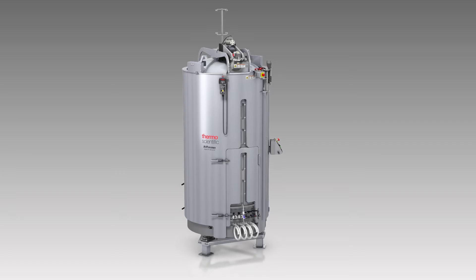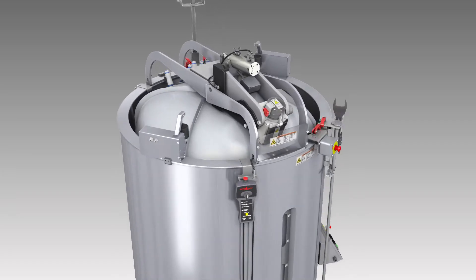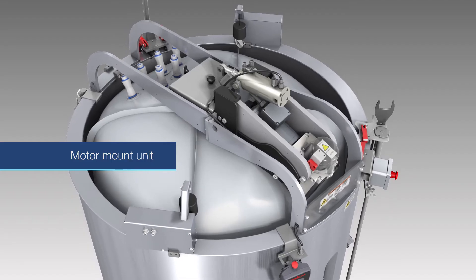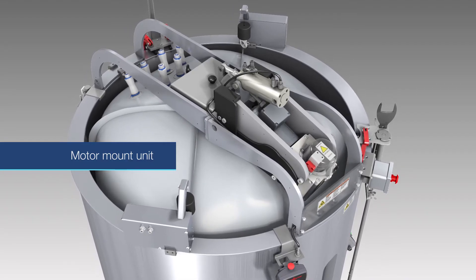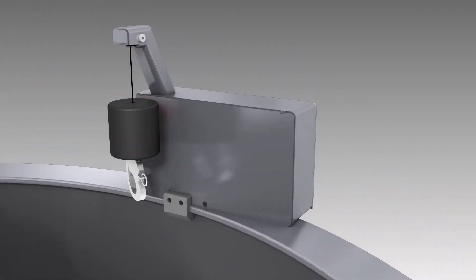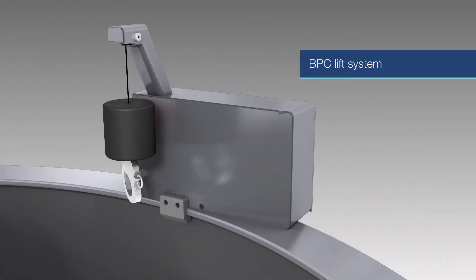Each of the 1,000 and 2,000 liter 5 to 1 SUBs comes configured with a new motor mount unit, which easily adjusts the motor and impeller shaft angle for different mixing volumes. The 2,000 liter SUB also has a new integrated BPC lift system, which assists in the installation of the BPC.